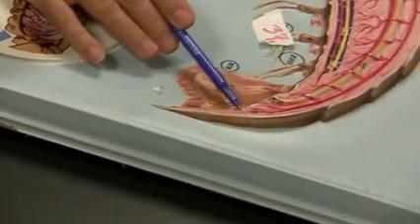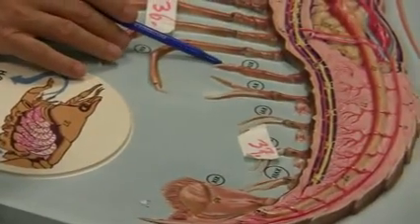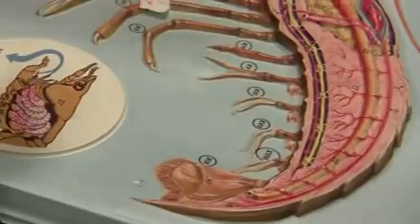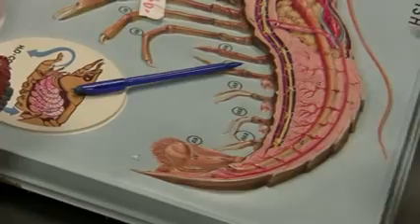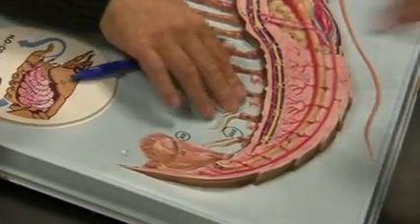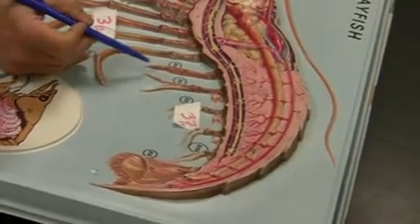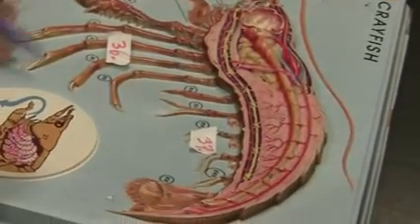Did you see that? Yeah. Uropod, telson, anus, swimmerets. The very first one indicates whether it's a male or female. So these are all swimmerets. If it is straight, it's a female. If not, then it's a male.